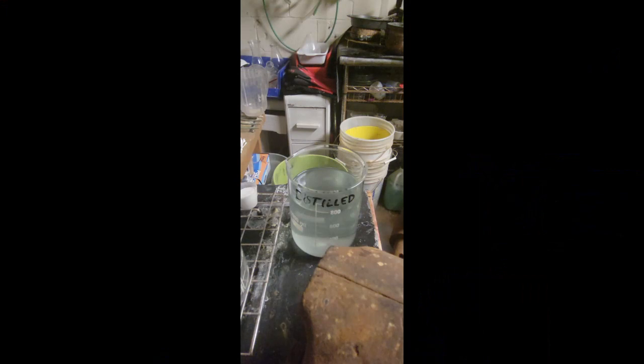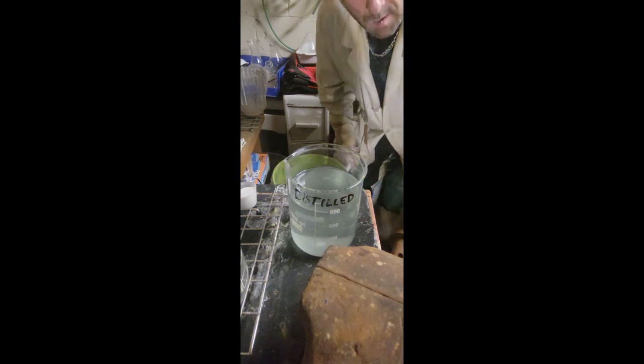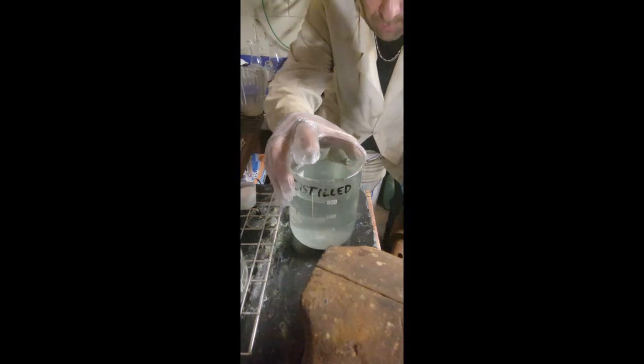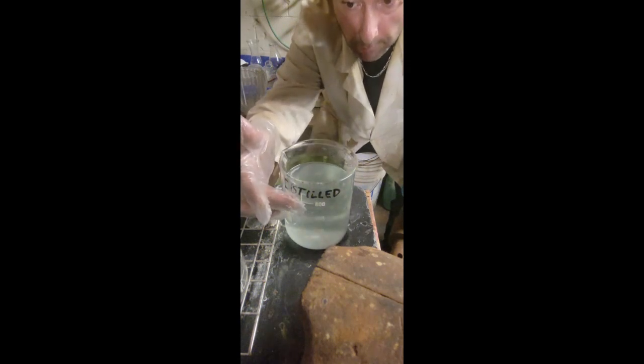Let's hit this. All right, here we are, back in my trusty lab. Okay, so what we're going to start out with, because we are only doing spoons and so forth, is get yourself a 1 liter beaker. It works well. Fill it up to 800 milliliters of distilled water.